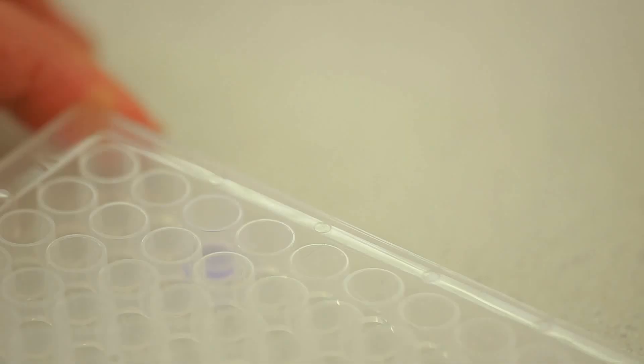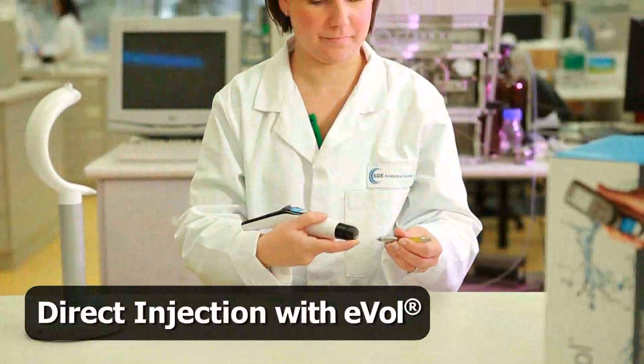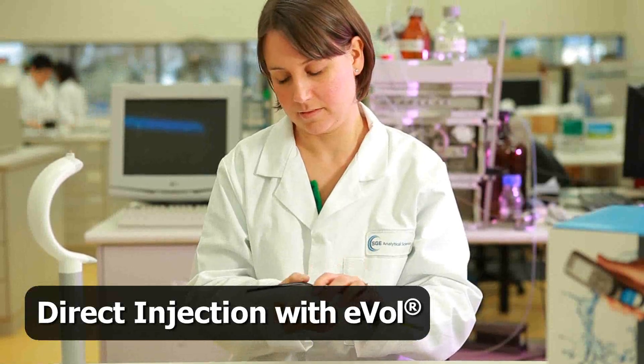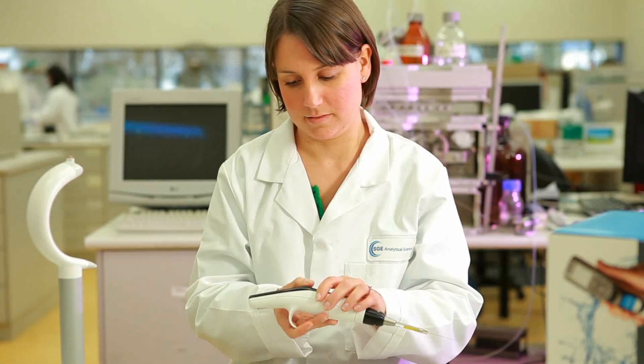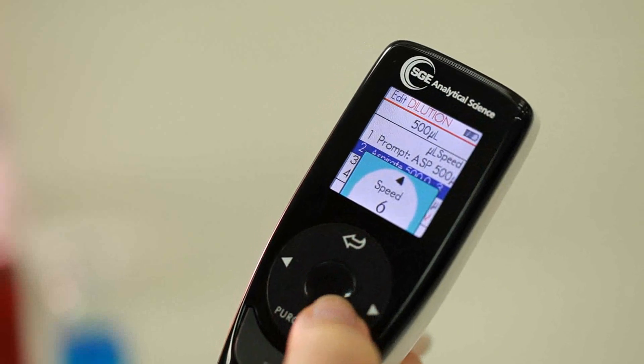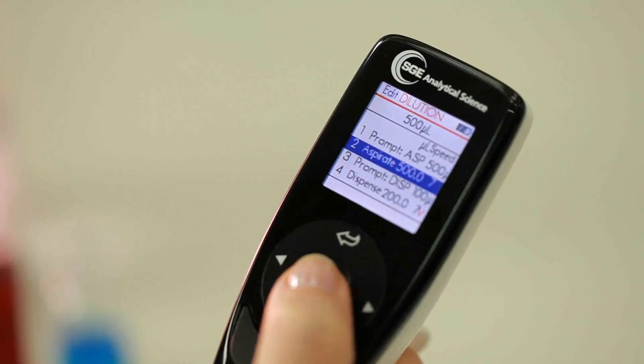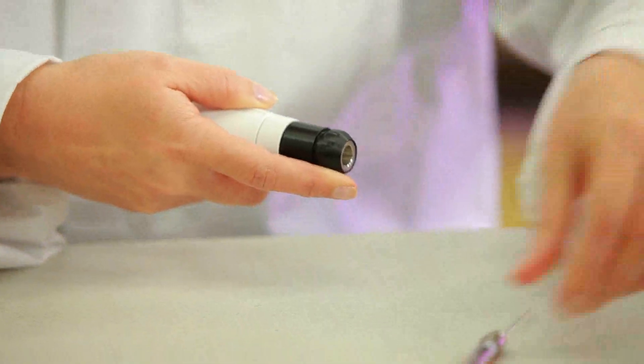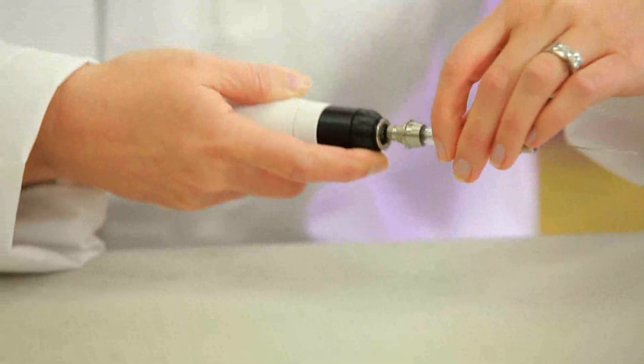Once sample preparation is complete, EVOL stainless steel needles allow direct injection into the required instrument through septa. Depending on the injection requirements, the injection speed can be increased or decreased as necessary. For faster injection speed, increase the size of the syringe to decrease the size of the stroke.